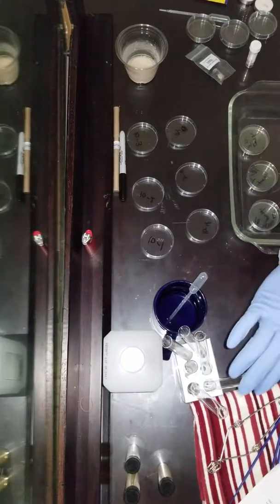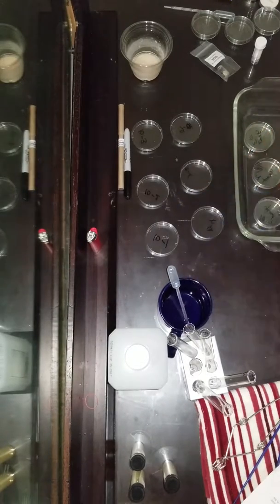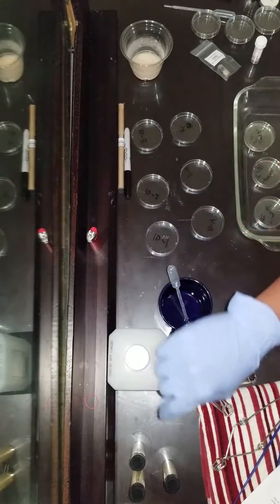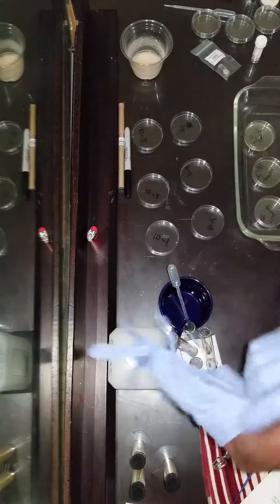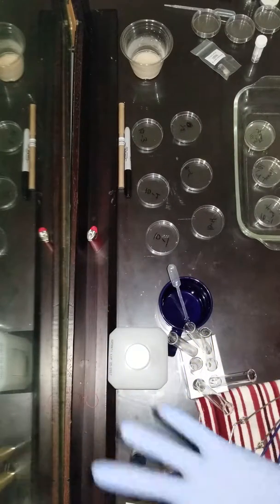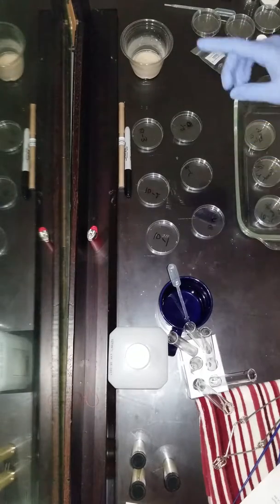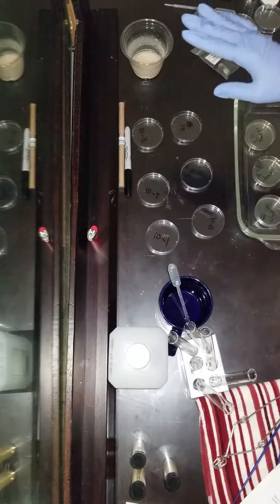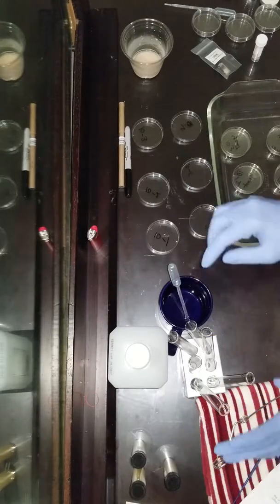I have my test tubes, my pipette, my diluted water, my alcohol, my agar solutions, and I'm just putting on my gloves. And my petri dishes, and again my test tubes sitting in the test tube rack.